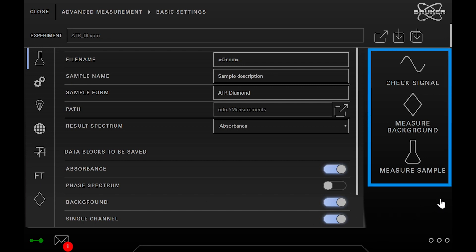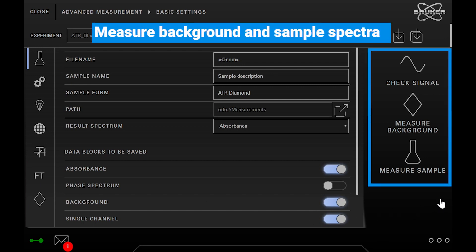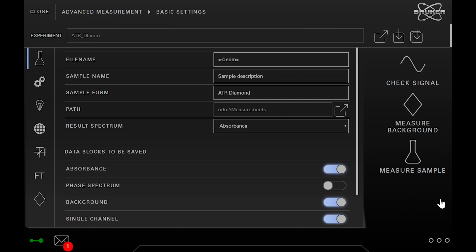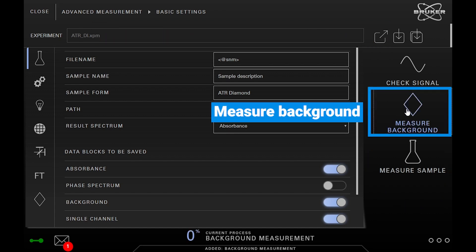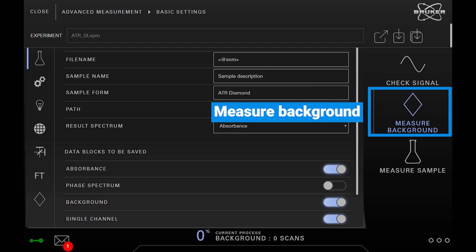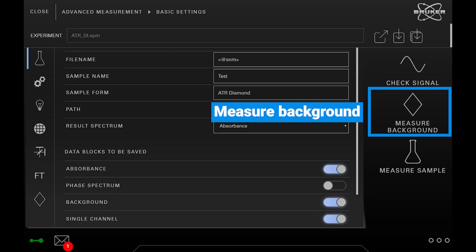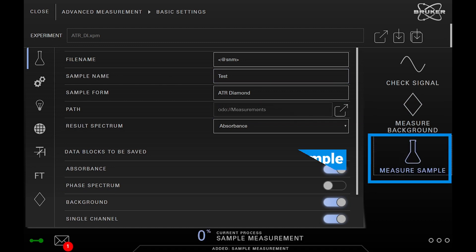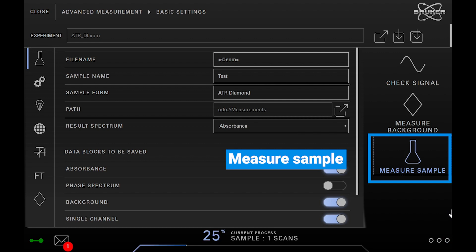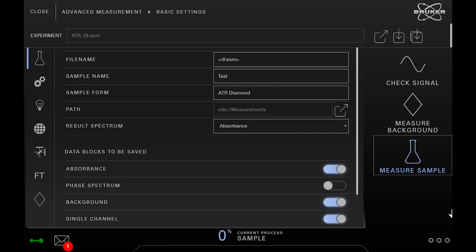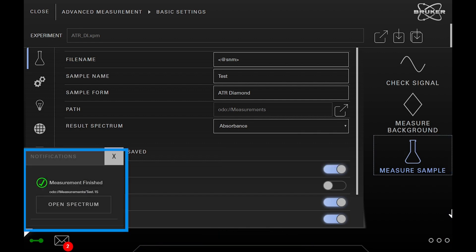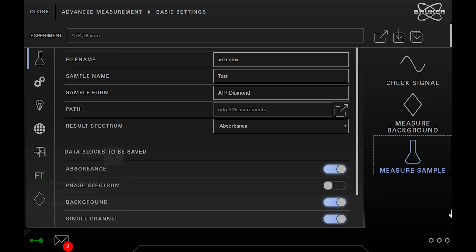On the right side we have controls to measure both background and sample spectra. Tap measure background in order to start the measurement. Start the measurement via the start sample measurement button. When the measurement is done you will automatically get a notification.